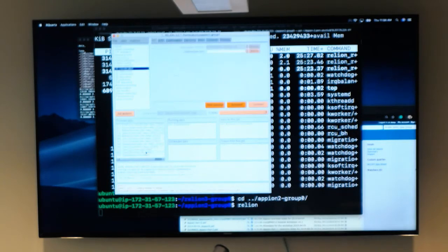Then I did a 2D classification, and there are 2 different 2D classification runs. The difference between these 2 runs is whether I ignored CTF corrections to the first peak or I didn't. In your tutorial, you'll see the relative outputs, but something that can happen in 2D classification is class collapse.